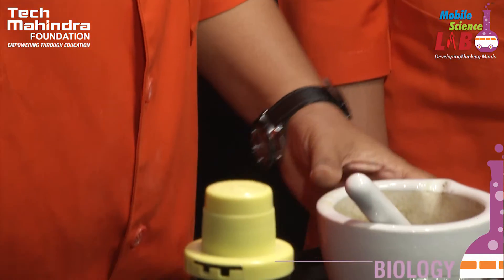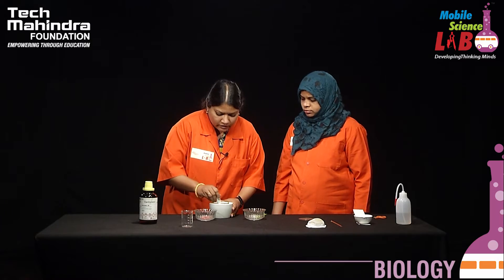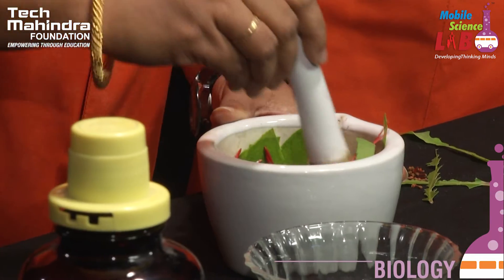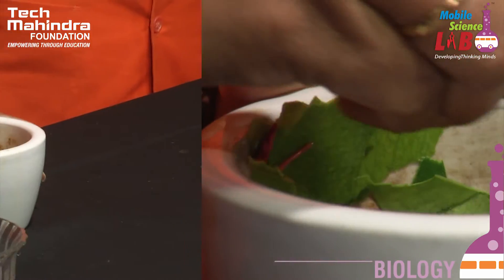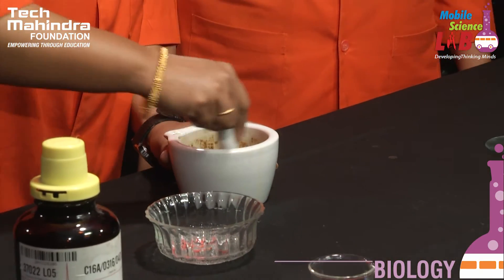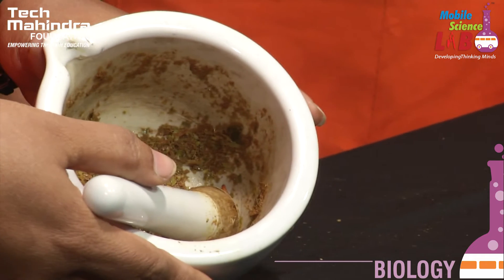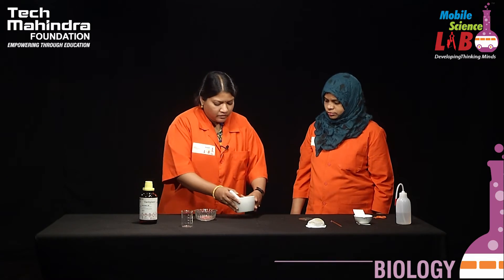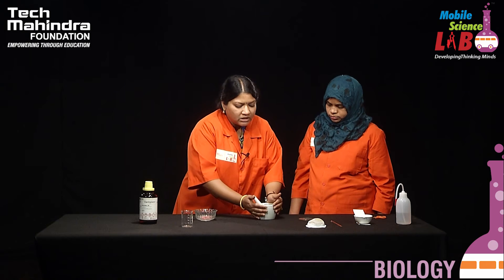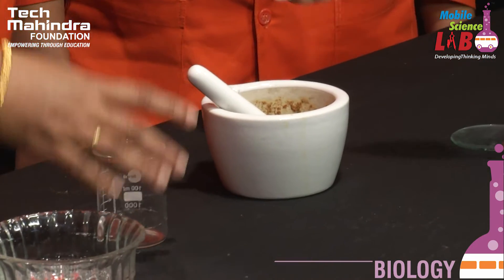We have to grind it for 5 to 10 minutes such that we get a clear paste of the leaf and flower petals. You can see the leaf and the petals of the flower are finely ground. Now we have to strain it and take the filtrate into a separate beaker using a strainer.